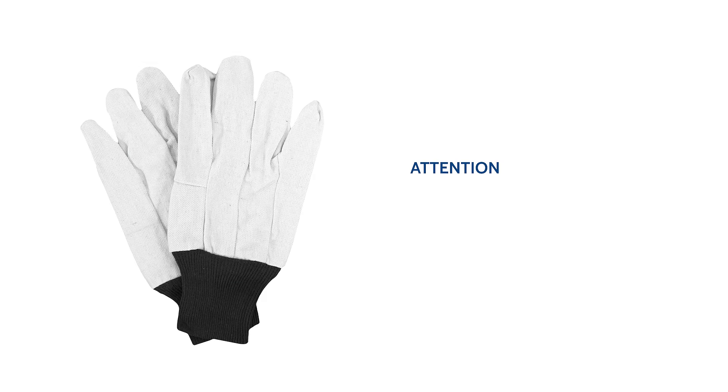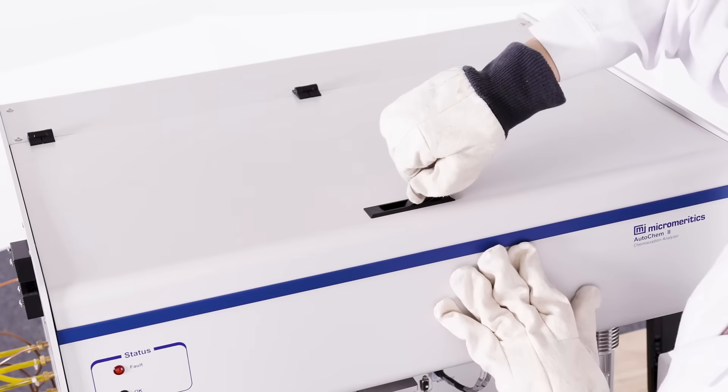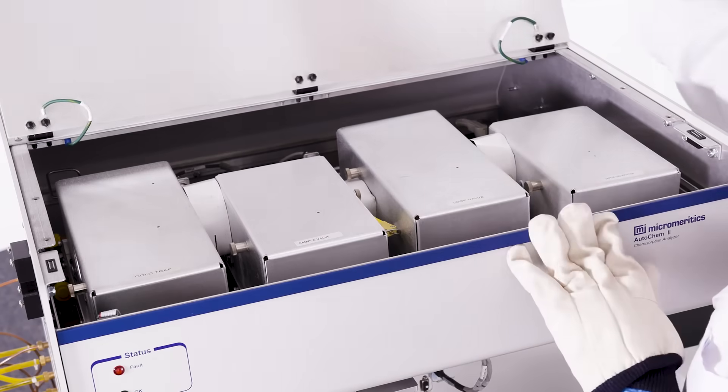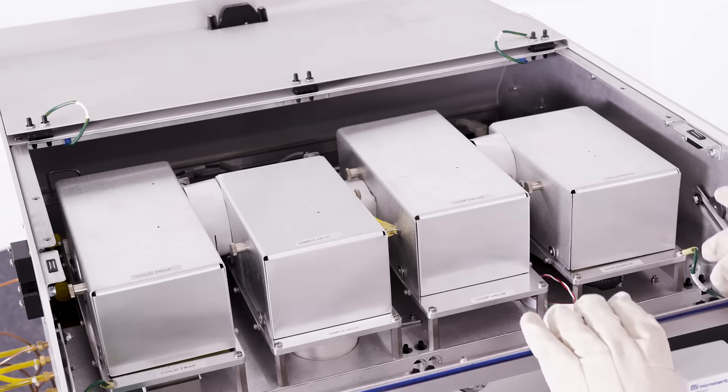Be sure to wear a pair of heat-resistant gloves to protect your hands. The thermocouple and the components nearby may be hot. Pull the handle up to open the hinge top panel. Open the front panel for better access.